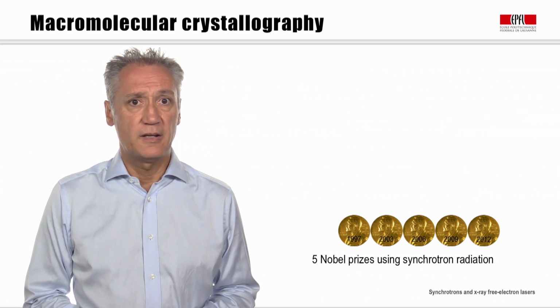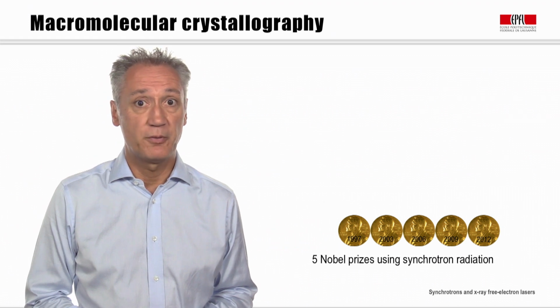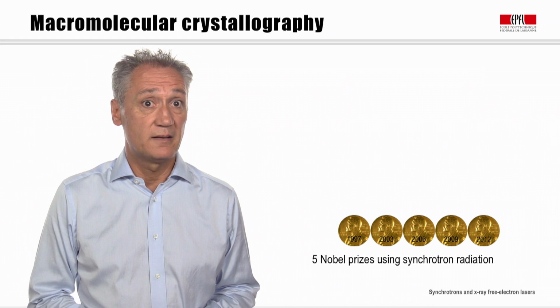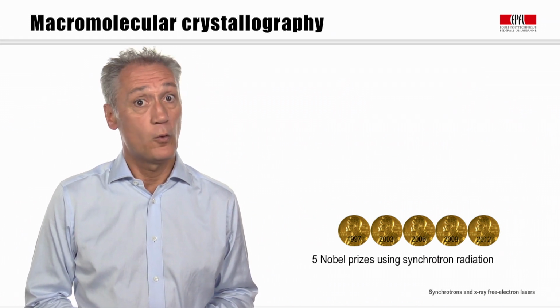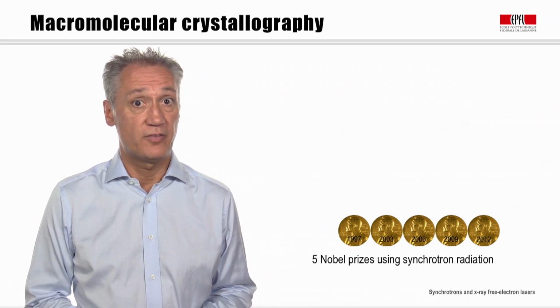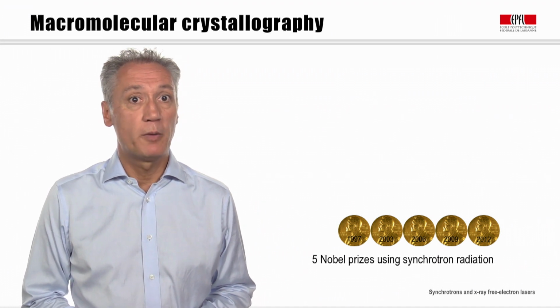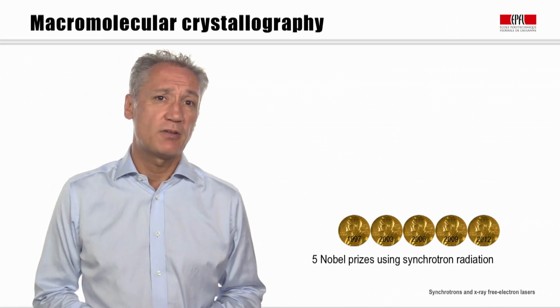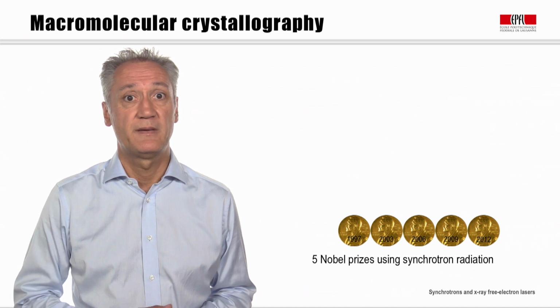Macromolecular crystallography is the study of macromolecules such as proteins, viruses, ribosomes, and other macromolecular assemblies, such as DNA and RNA, and is often also called protein crystallography, or PX, as proteins make up the majority of the studied structures. The transition from small molecules to macromolecules is somewhat vague, but lies at around a few thousand daltons. A dalton is an atomic mass unit.